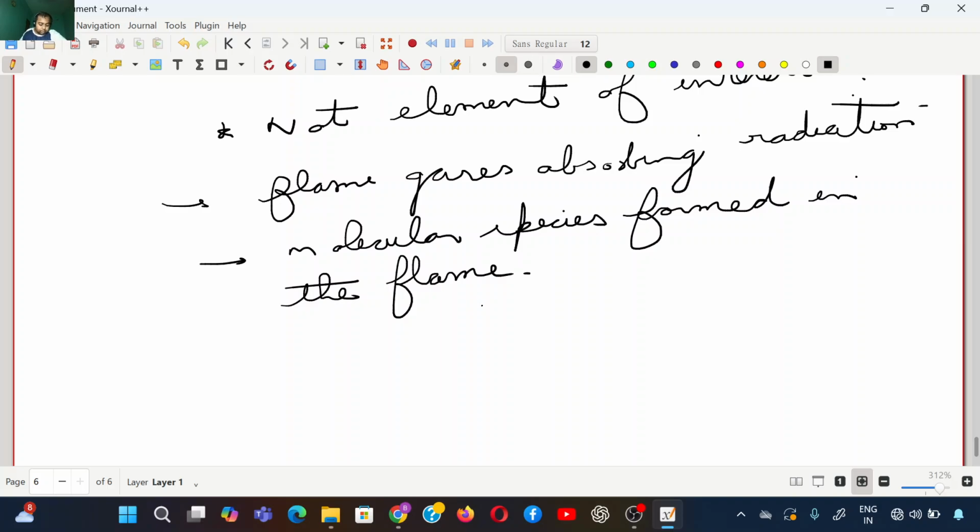So how do you correct it? Basically, because of this, it can reduce the analyte signal or it can exaggerate or mask the true absorbance. So the correction method is to use a reference solution without analyte and subtract its response.